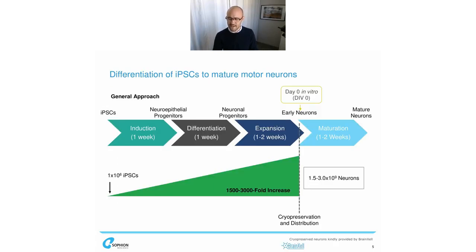You've seen this slide already earlier, but I've copied it over just because I wanted to add some more words to it, how we've been using it. So all the work on the left side, as you can see here on the left side of that dashed line, was done in the lab of BrainXell. And then once they were cryopreserved and shipped over to our laboratory in Denmark, my colleague, Dr. Katla Røskva-Rosholm, who really did all the work, put them in culture here.